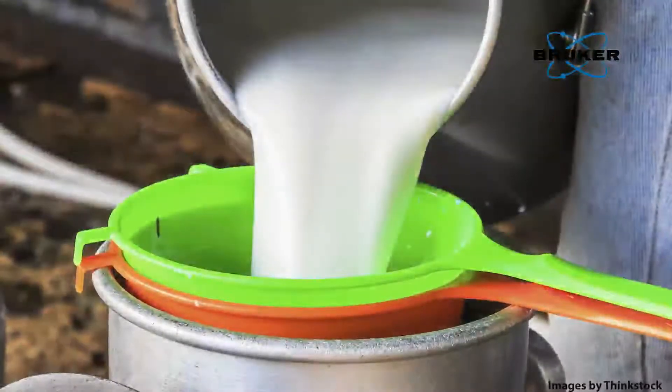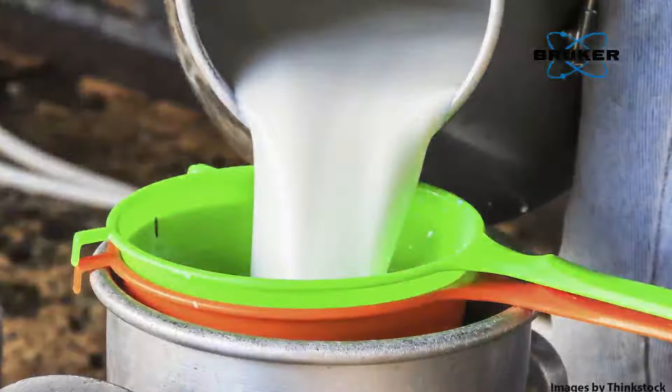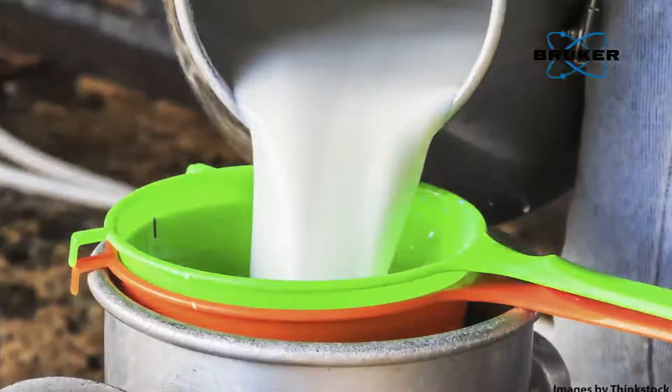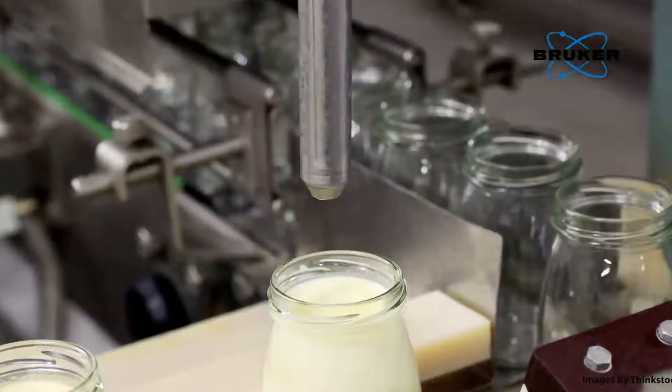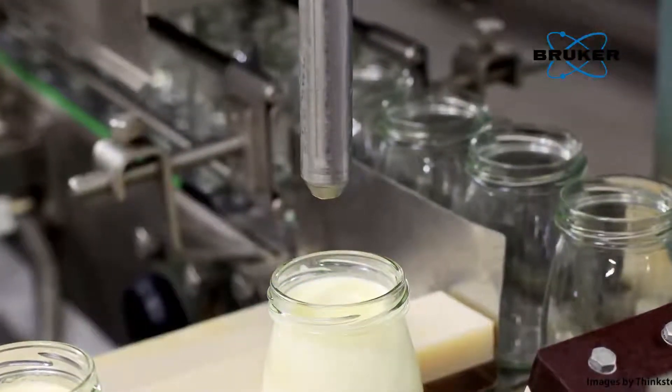Often, the first manufacturing steps are skimming off the cream and then ultra-filtration of the skim milk. Cream and UF skim milk are then added to standardize the fat and protein level, ensuring a consistent starting point in the production process.